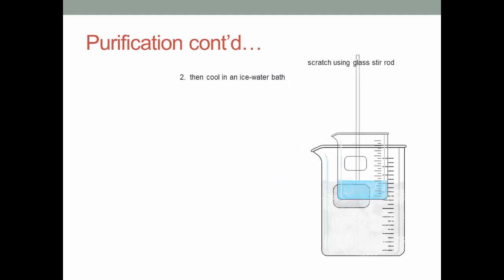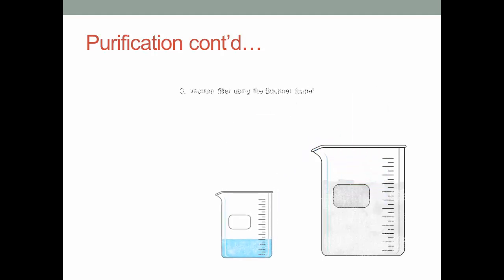Then, cool the solution further in an ice water bath. Once you think you have all the crystals you can get, vacuum filter using the Buchner funnel.